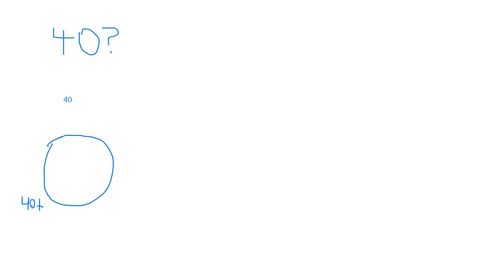So in this case, 40x, because of the 4 and the 10. Most times when you see pictures from the microscope, people zoom in more. The 4x is more used just to find your sample. Then once you find it, then you look closer. But this is just an example.